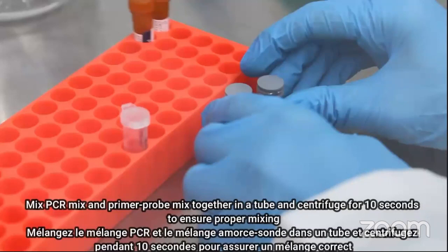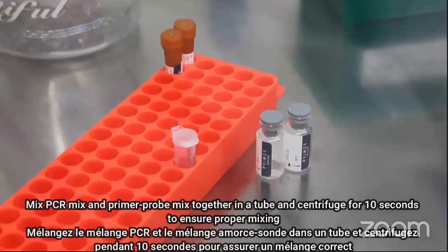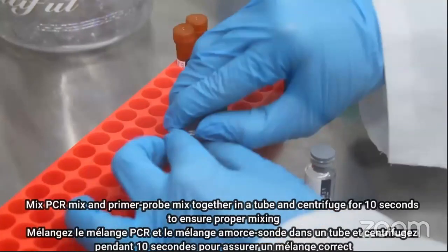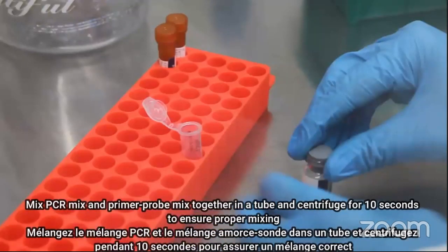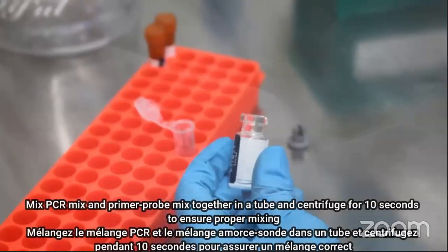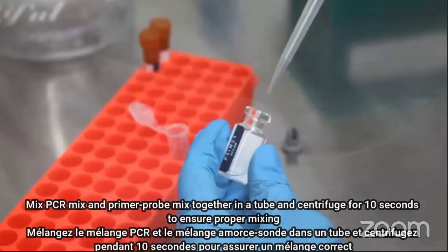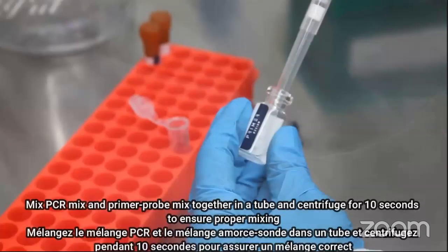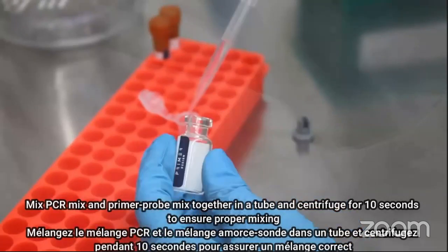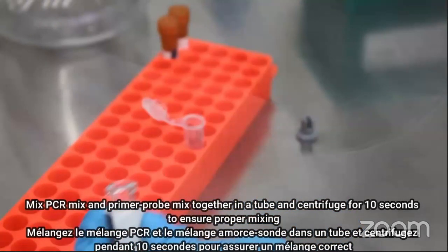I will be showing you how to make a master mix for 96 samples. For 96, we have to take the whole content of the qPCR mix that is in the glass vial, as you can see. We have to be careful while mixing it through pipetting. Take it out and put it in a fresh tube from both the vials for 96 samples.